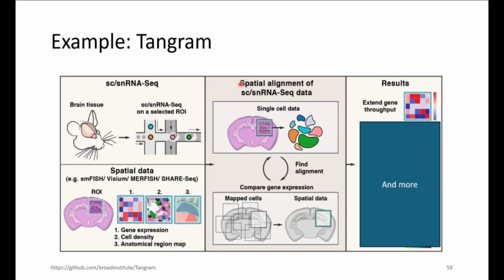The intuition is that in the Xenium dataset for 100 genes, you know how they are expressed in space. Then you use these 100 genes to align your single cell RNA sequencing set, right? You have the same cells in the single cell RNA sequencing. And from that, you impute the genes that you didn't have in space.